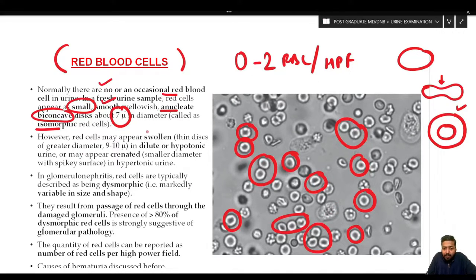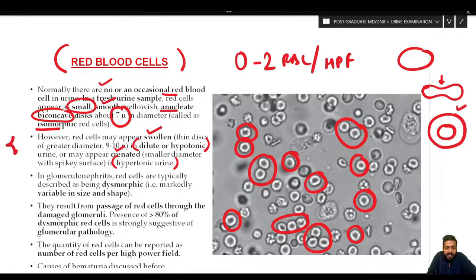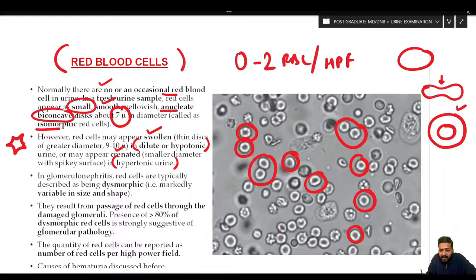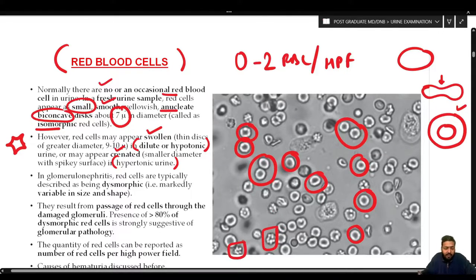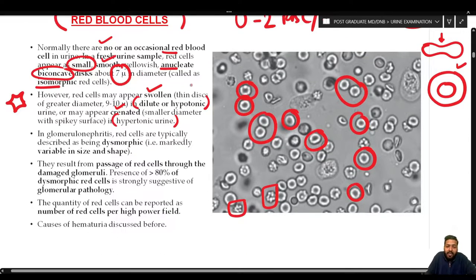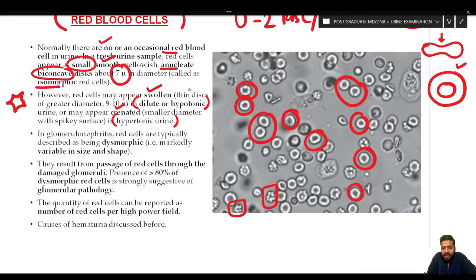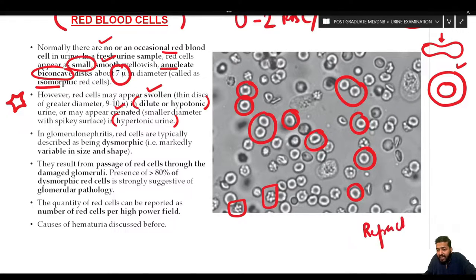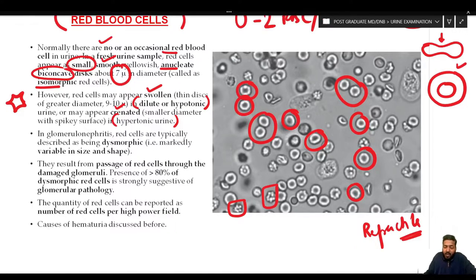Red cells may appear swollen if the urine is dilute or hypotonic, or crenated if present in hypertonic urine — crenated RBCs have an irregular spiked appearance. RBCs are refractile in nature, meaning if you change the fine and coarse adjustment they appear to shine. All different causes of hematuria will show RBCs in urine.